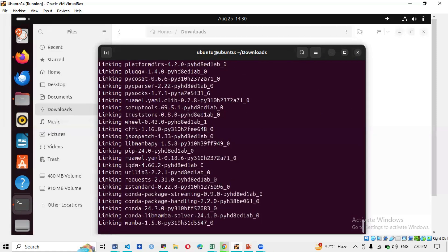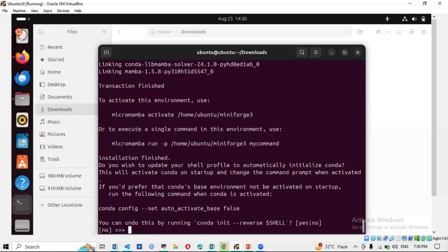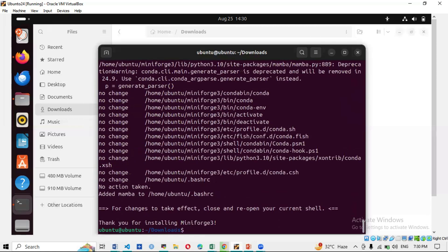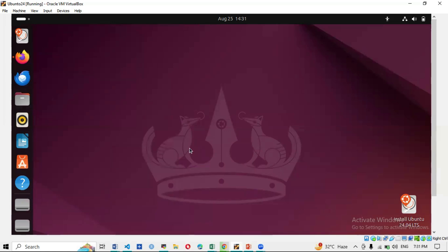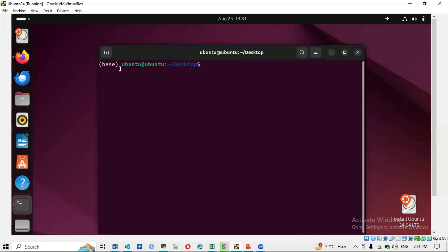You only need to install Miniforge once. When asked 'Do you wish the installer to initialize Miniforge3 by running conda init?' type 'yes'. After that, Miniforge is installed. Close the terminal and reopen it. You'll notice the prompt now shows '(base)' before the path — before installation it just showed 'ubuntu', now 'base' appears, confirming Miniforge is activated.